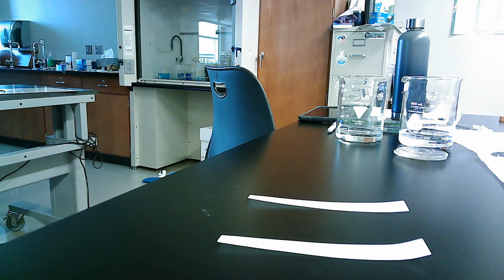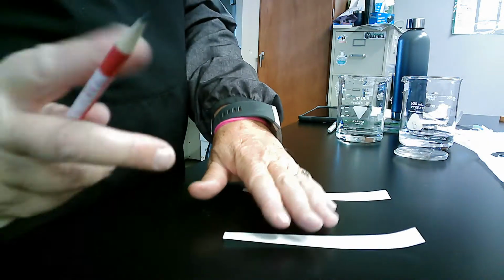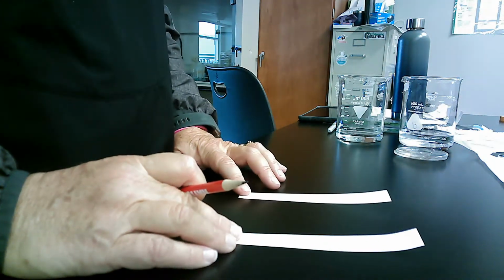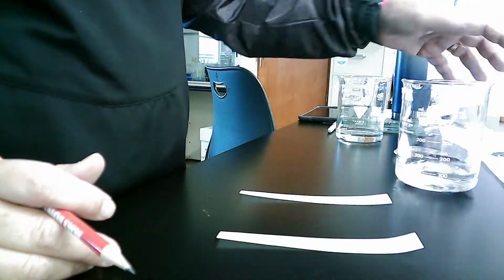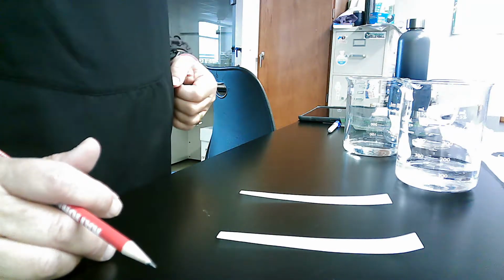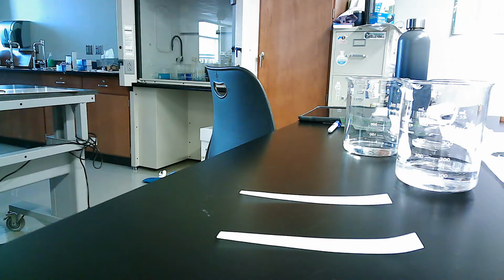So the first thing we did is to understand, hopefully you watched your 4.9 AP Daily video, where it talked about separating solutions and also talked about chromatography. So chromatography is a way that we separate based upon polarity. What we are using is chromatography paper, which is very similar to coffee filter paper. We're going to use two different solvents because we want to know which solvent works better to separate this solution. We're going to use a dye solution, which is just a mixture of food dyes.